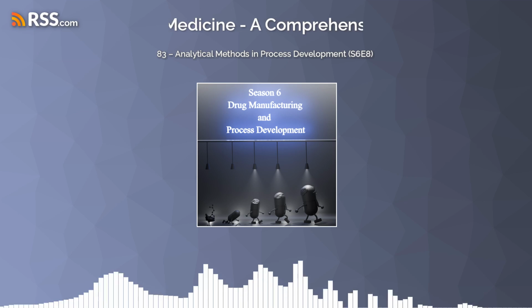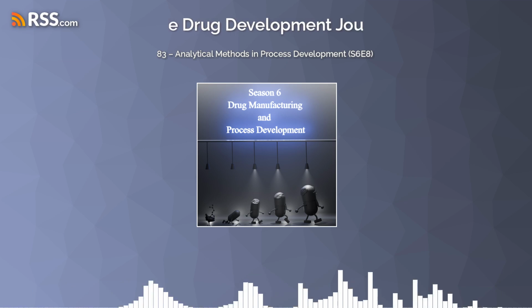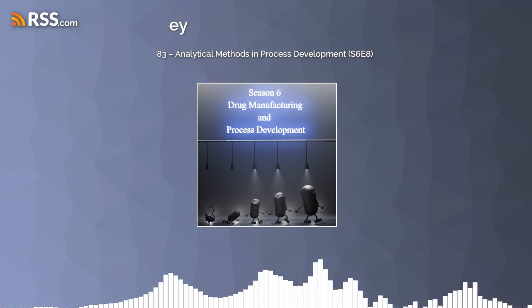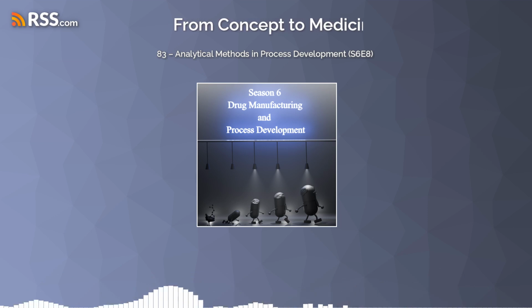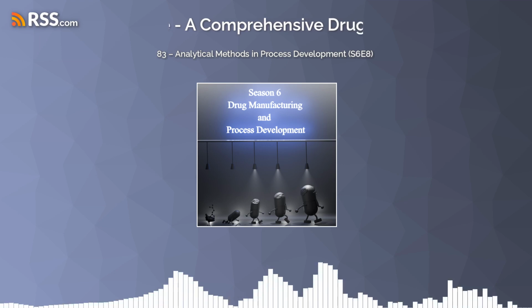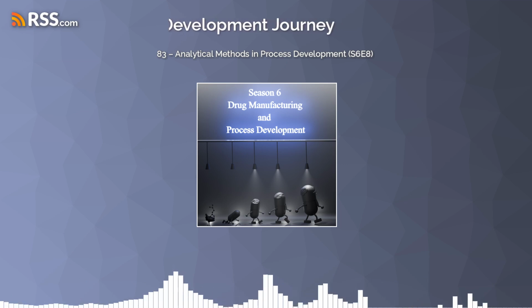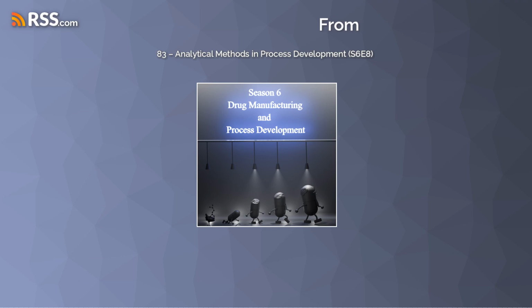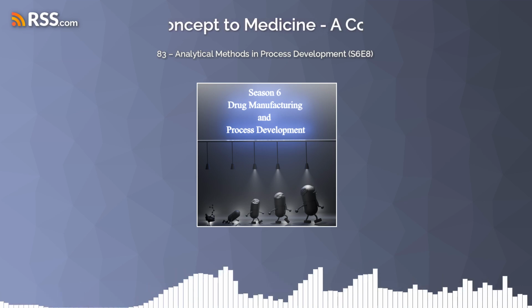And how is that structural information useful in process development? Well, one example is NMR, or nuclear magnetic resonance spectroscopy. We have a source dedicated to NMR. We do, and it's a great source. NMR can give us incredibly detailed information about the connectivity of the atoms within a molecule. So essentially, it's like a fingerprint for that molecule's structure. And you can see if you built it correctly. Exactly, especially if you're synthesizing a complex molecule with lots of rings and branches and things like that. You need to be sure that you build it correctly. Right. And NMR can provide that confirmation.